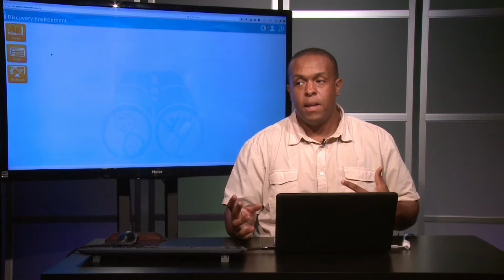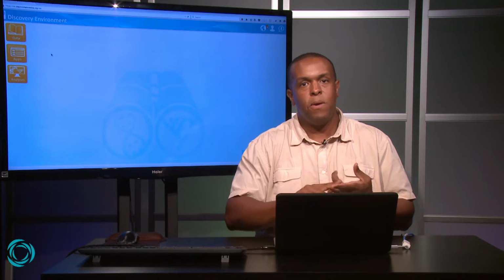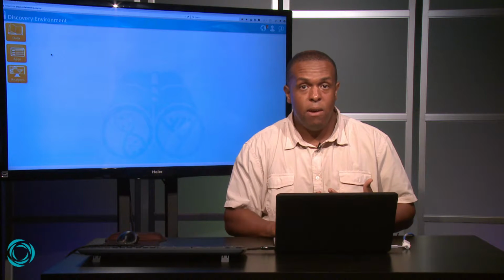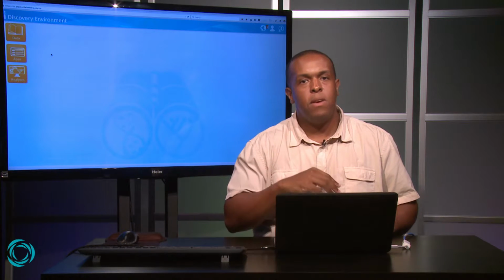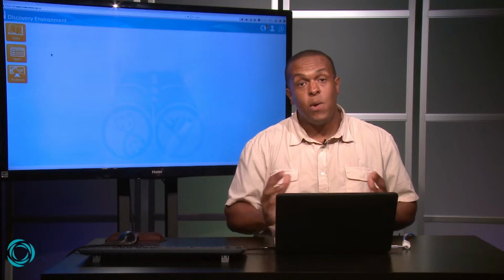Now let's go to the second part, which is how do we actually analyze that data once we get in there. So far we can upload and download data. We can share that data with any colleague or even people outside who don't have an account. We can even add some metadata to that, and maybe I'll show you a little bit more on some things that I know have. But you can do a lot with data now, even just looking at that quick demo. How do we analyze the data?